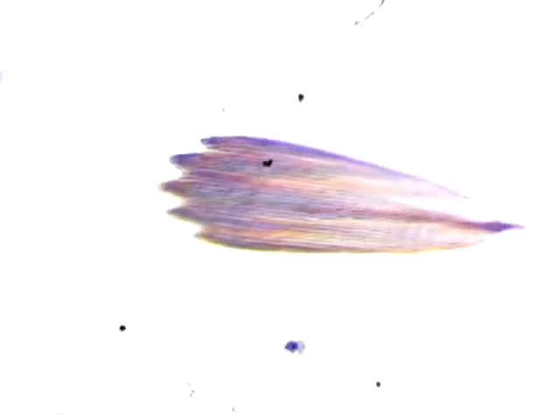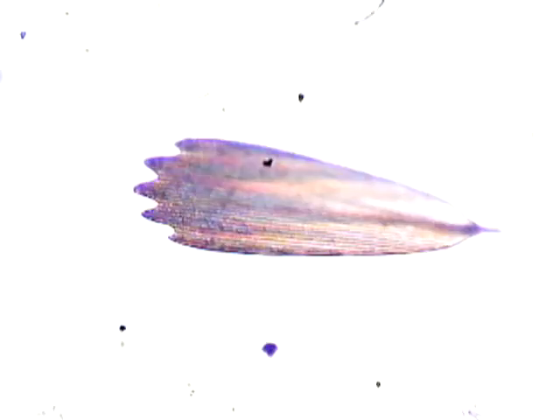See there? Aren't they neat? They're really amazing. Look at that — that's one of your edge wing scales like you saw, attached to the wing, but of course now it's off on its own. Let's see if I can get that at extreme power.